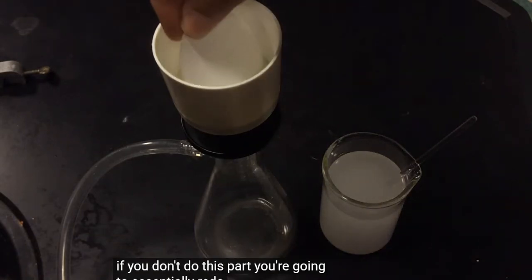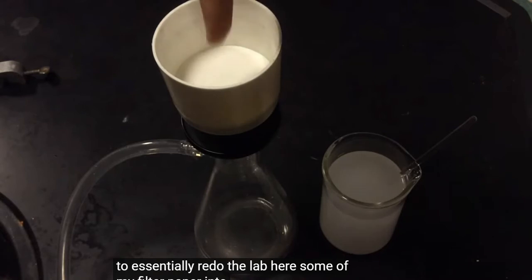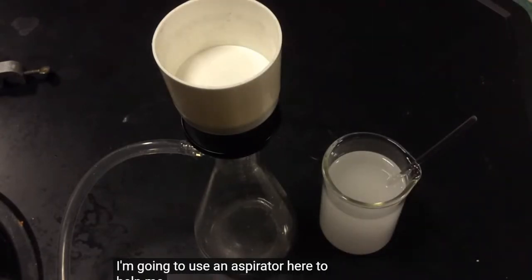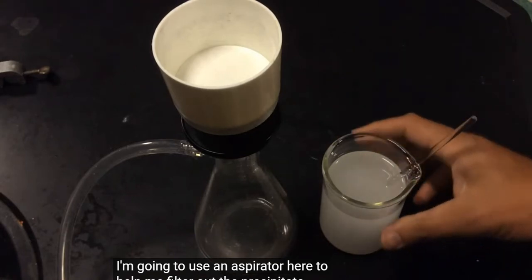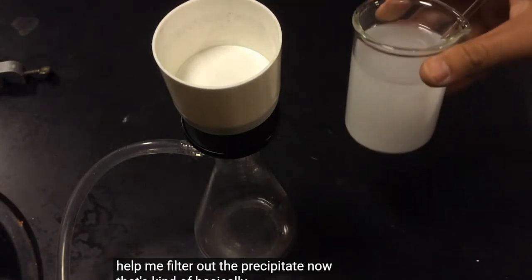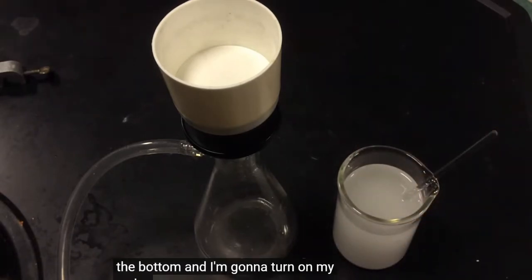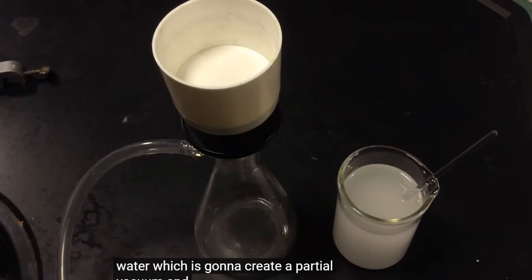So I'm going to put the paper into my Buchner funnel. I'm going to use an aspirator here to help me filter out the precipitate that's basically collecting on the bottom. And I'm going to turn on my water, which is going to create a partial vacuum. And this is an important step here.